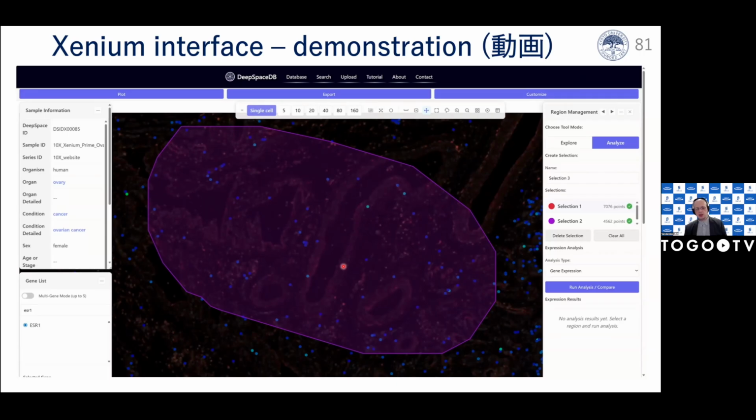This video was not edited, so I think I'm showing the real behavior of the database, and I think it's really fast, thanks to those ZARR stores.